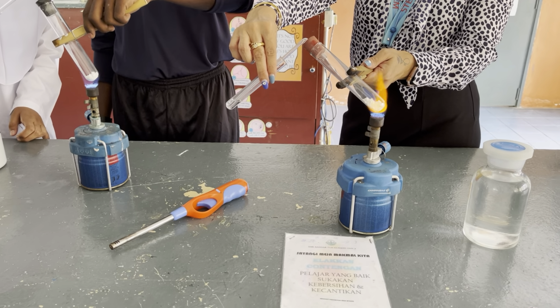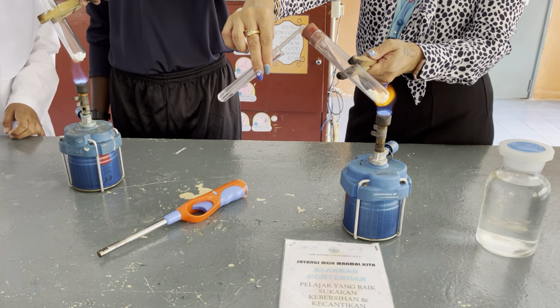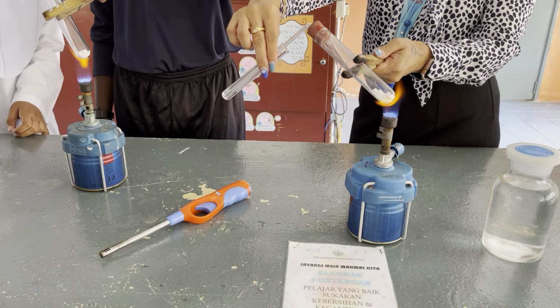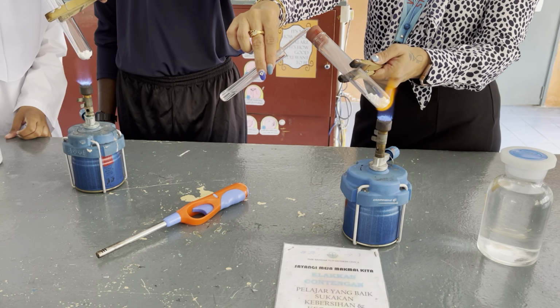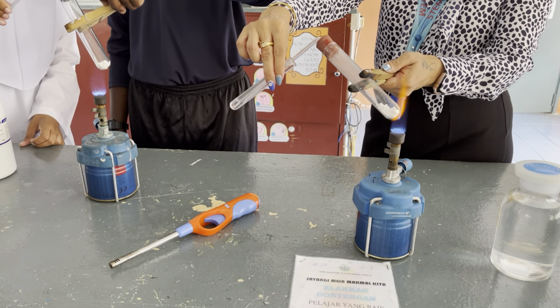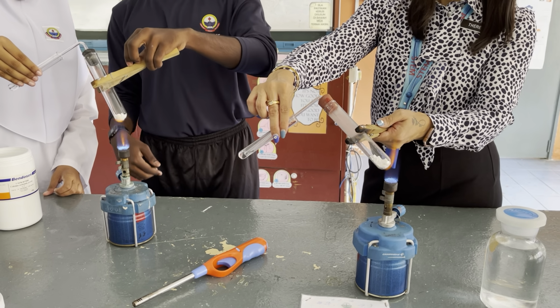Okay, you can see there's gas, bubbles, right? Can you see bubbles, Adriana? Yes. Okay, that means there's gas being produced when you heat up calcium carbonate or calcite. But you do not know what gas it is until you can see there's a difference.